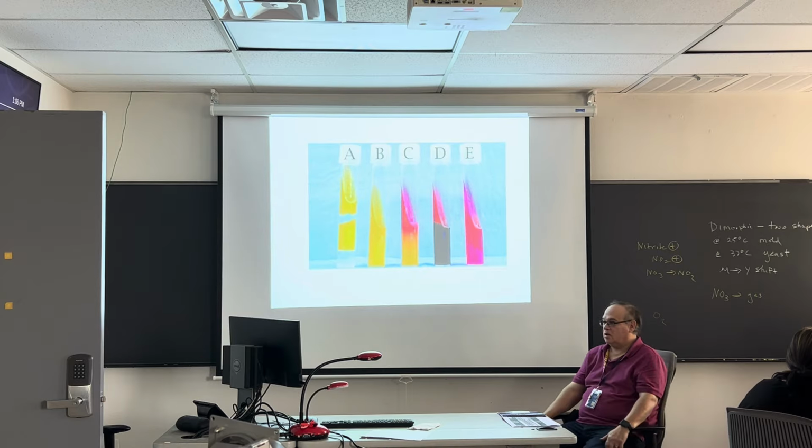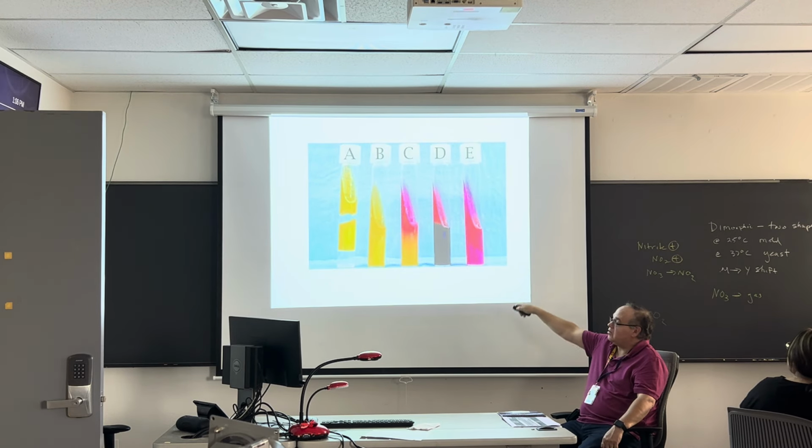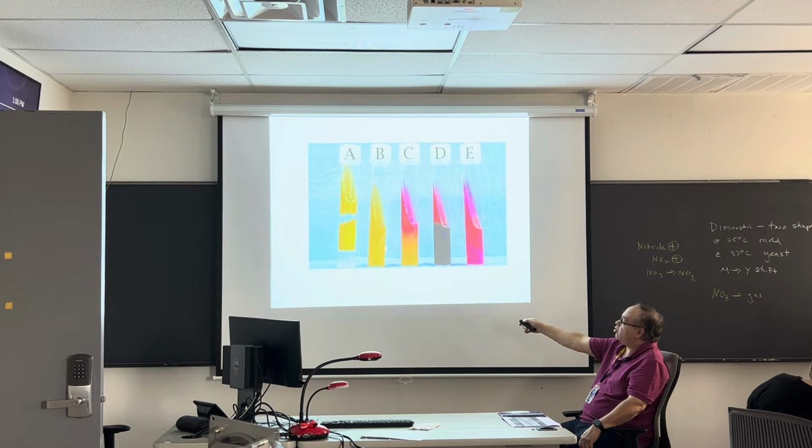Okay? All right, so let's just practice real quickly because we have some time. So look at what craziness is going on here, right? This is somebody who stabbed it and then went all the way through. So I've got what here? A gas. Let's do this one. I've got cracks and fissures. I've got what?